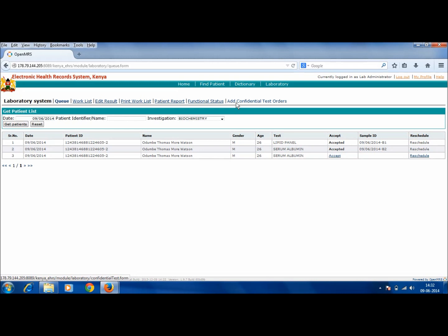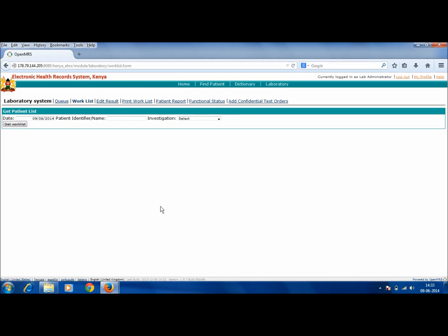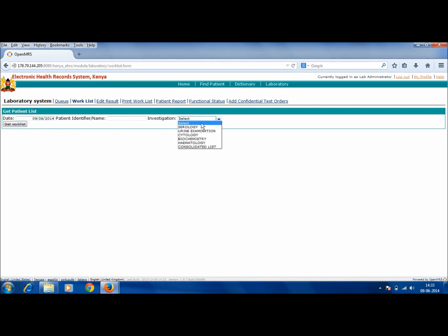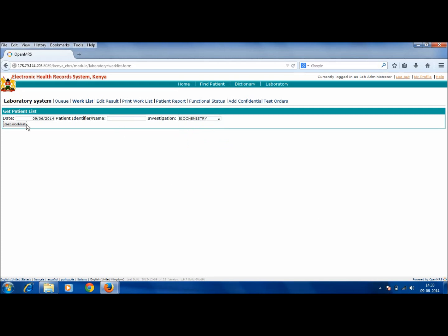Once the tests have been accepted, the next tab is Work List. Work List is a list of all those tests which have been accepted by the lab administrator. To get the Work List, select a date and select the investigation. A particular investigation can be chosen or a consolidated list can also be generated. A particular patient can be searched by typing in the name or the identifier. Then click on Get Work List.